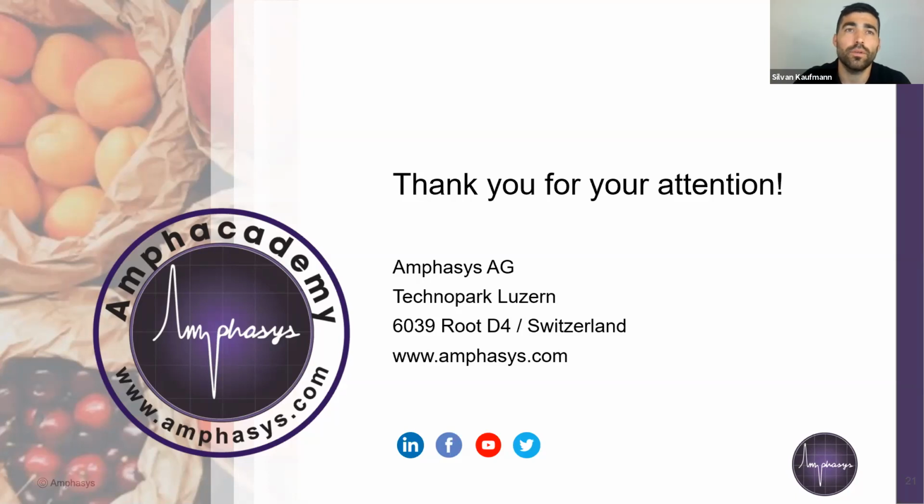Thank you. Then another question, whether those findings and developments are also applicable to other crops, not just wheat, so barley and rye. That's an important point. The anther picking is not a big deal, since anthers also exist in barley and rye, so we can use that. This funnel collection method we tested in wheat, so it has to be tested in barley and rye. If the anthers are extruding by the cutting, then it's not a big deal, it can also be measured. And the chips that we are using are the same. So basically, the method is really applicable to these crops.